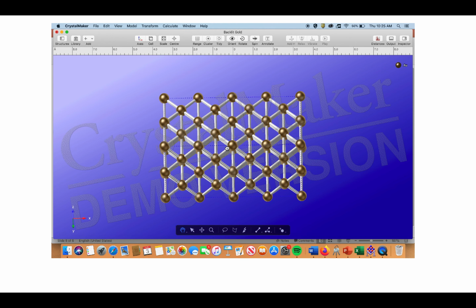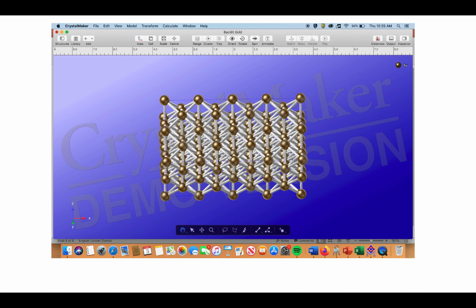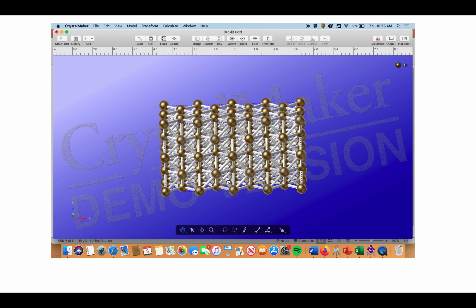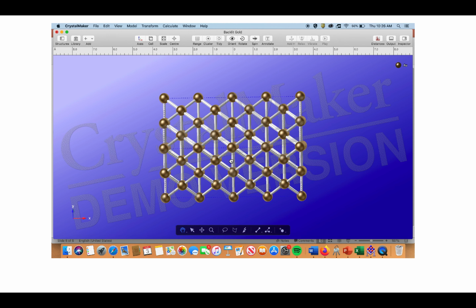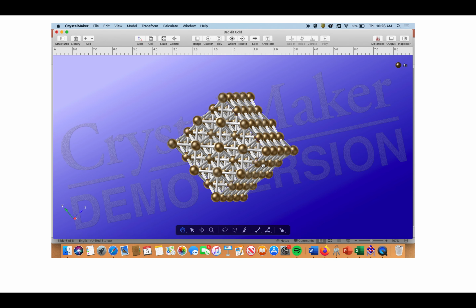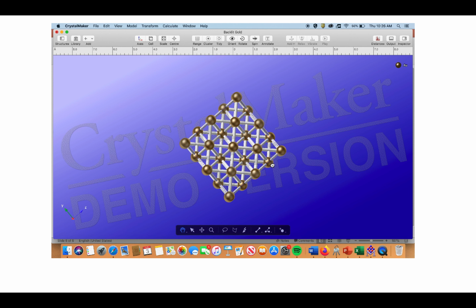Notice how when we rotate this, there are particular times when it's aligned and we can really see it become symmetrical. My daughter used to play with this. She used to think this was a video game. She would take it and spin around the crystal structures until they almost magically became aligned.